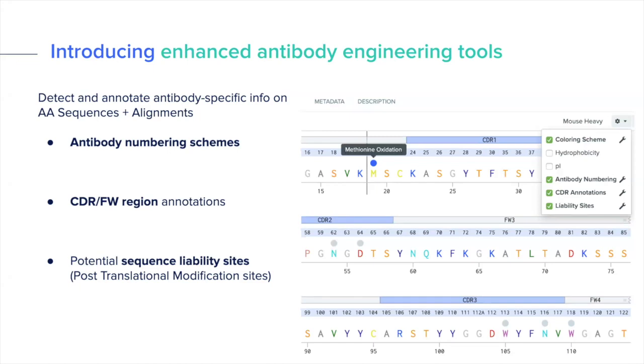And then the other question, in the same vein, was, if somebody answers your questions or sees that you app mention them and has a reply, will you be able to see those answers? The answer to that question is again yes, assuming they go into the notebook entry and leave some sort of comment, you'll be able to see that comment there. If they app mention you explicitly, you'll get an email, and everything is captured in the version history of the notebook entry as well. So I could see a timestamp that says, Andrew left a comment at 10 a.m. on 6/12, and jump to that particular edit to see what they said. So those are some of the answers on the more collaborative pieces.